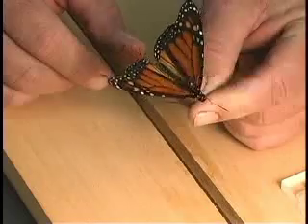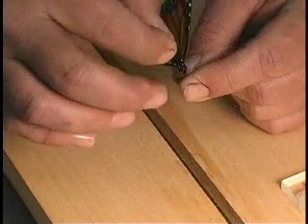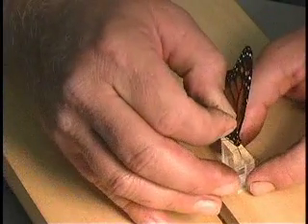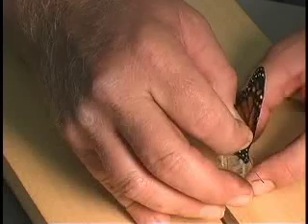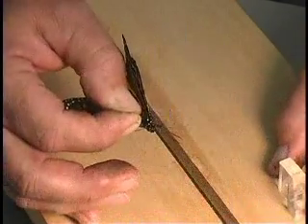Okay, now that you have the pin inserted through the insect's thorax as straight as you can get it by visual examination, then grasp at the top of the pin, insert it into your pinning block from the bottom side, and that will position the insect at the proper height on the pin.